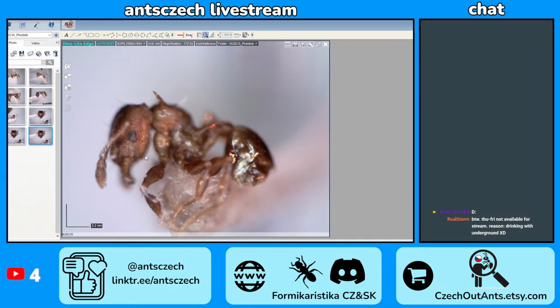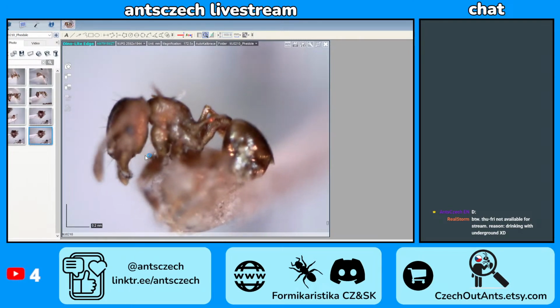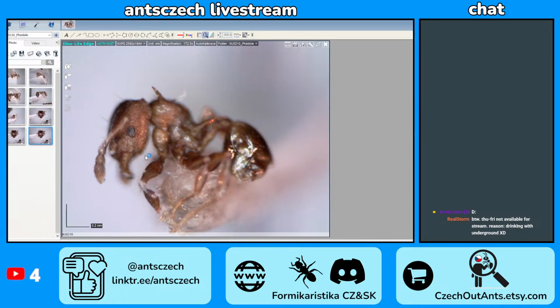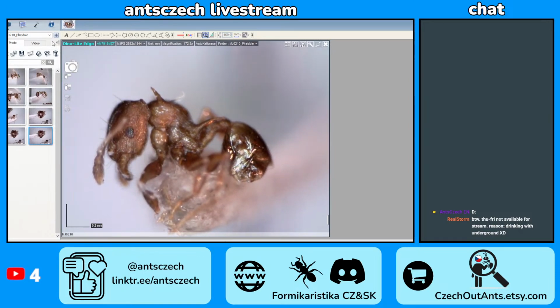What is the difference between fragilis and puberulus? Wow, the spine is super long. Wait, wait, let me see. Oh, damn, that is cool.